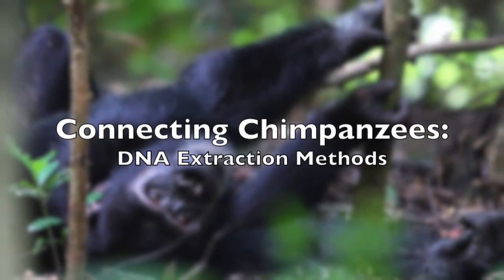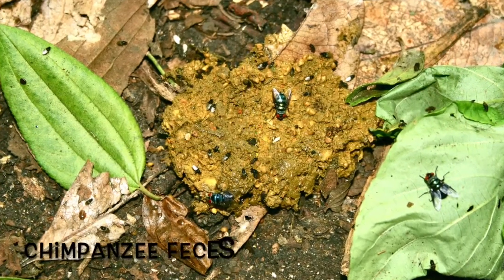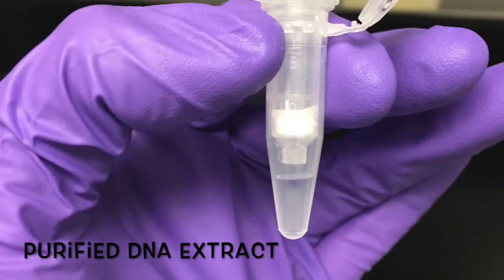Hello project backers. Today I'm going to show you how I start with this in the lab and finish with this — a tube of purified extracted DNA.